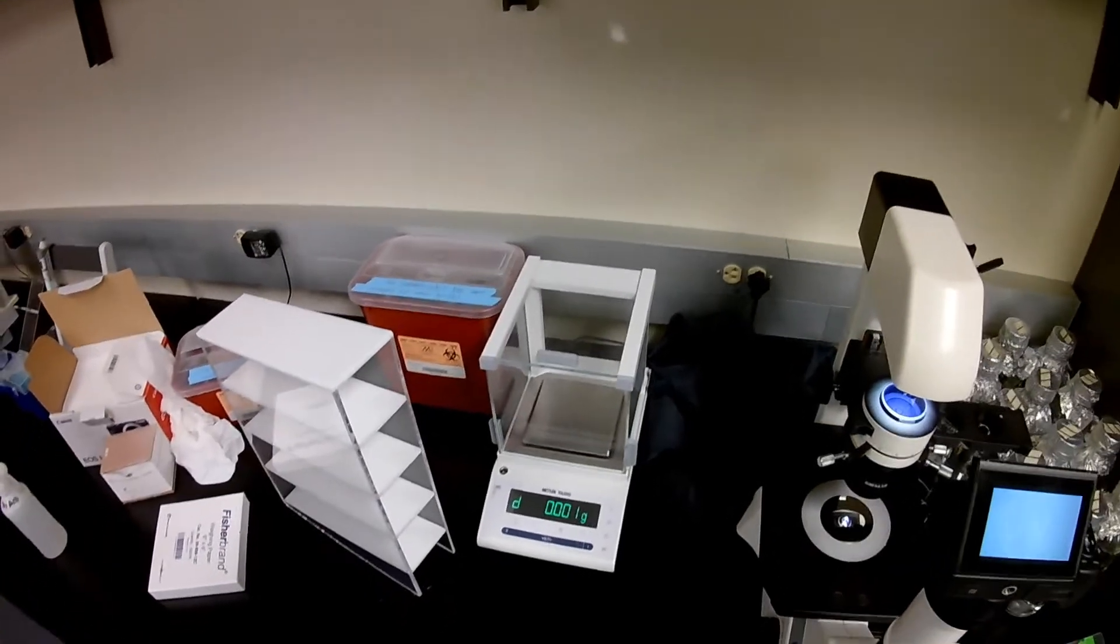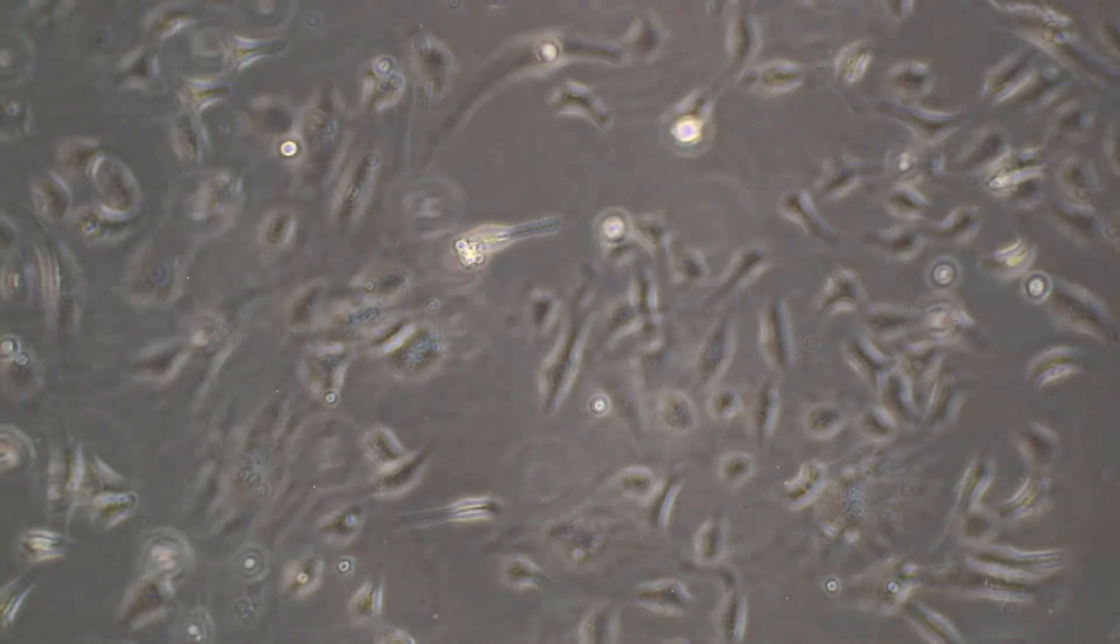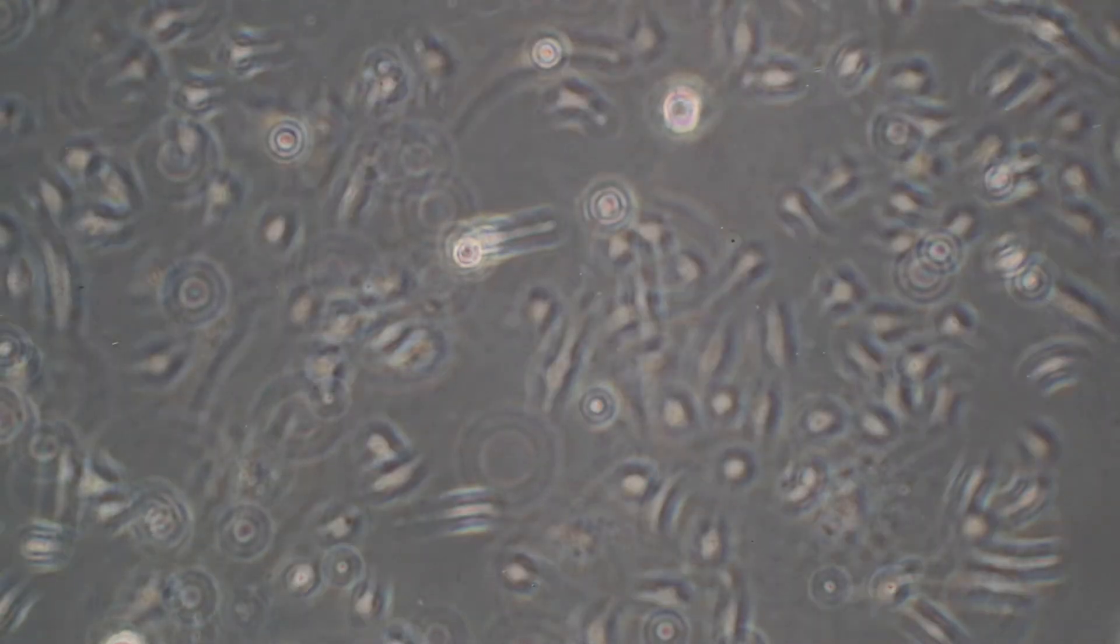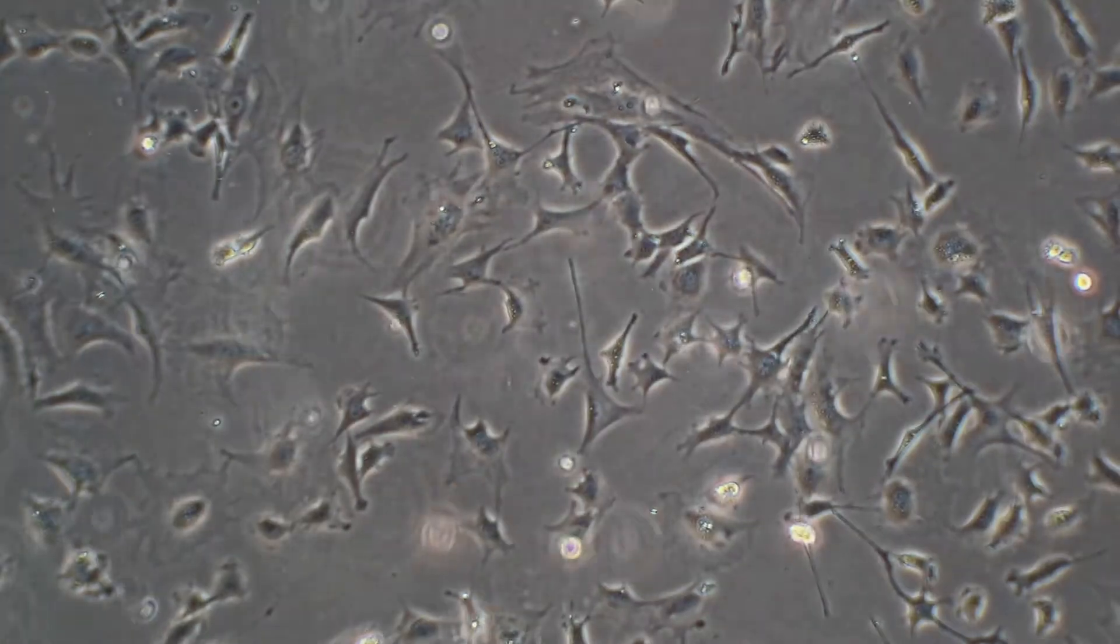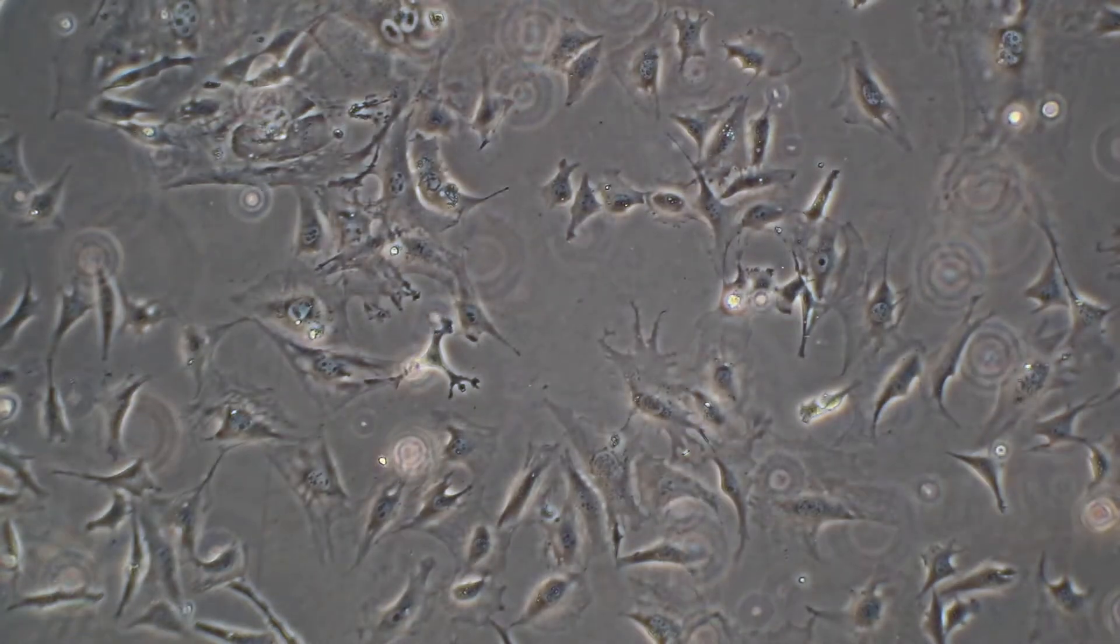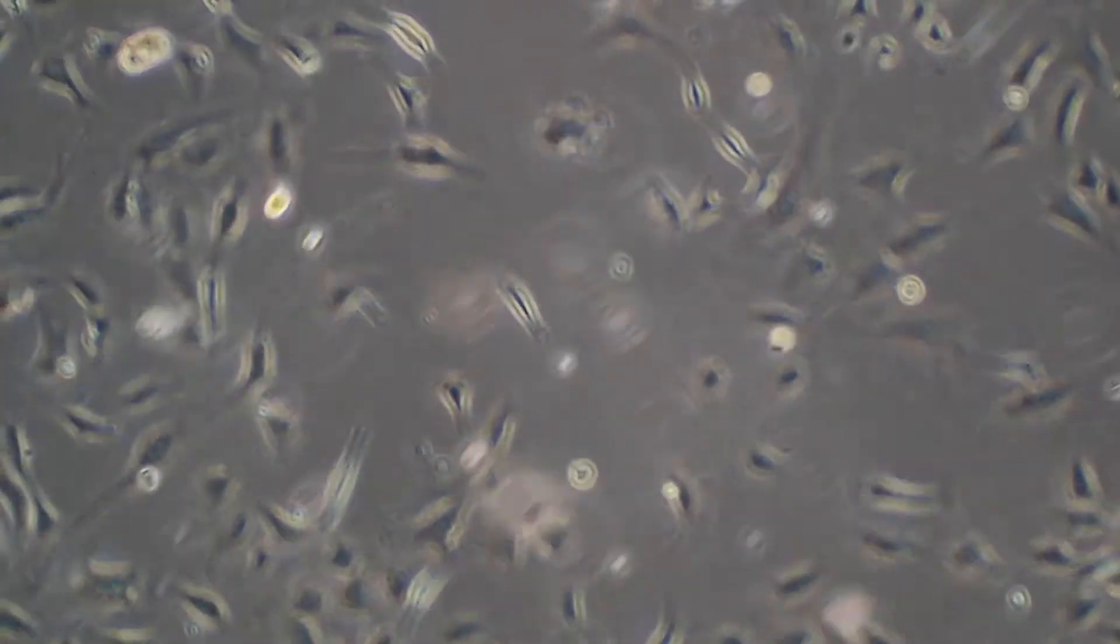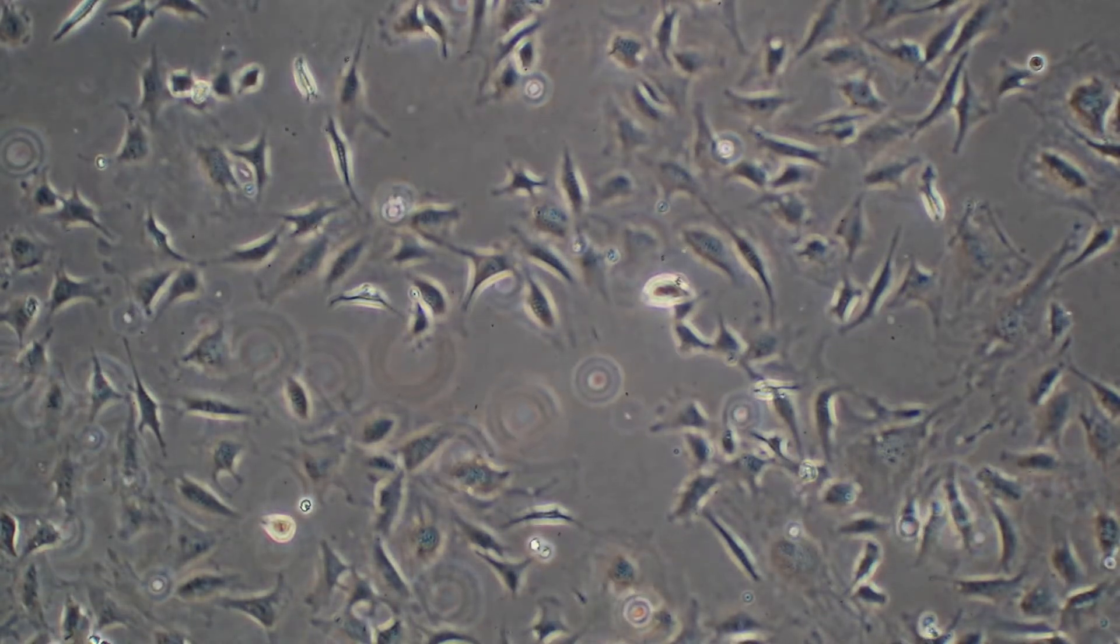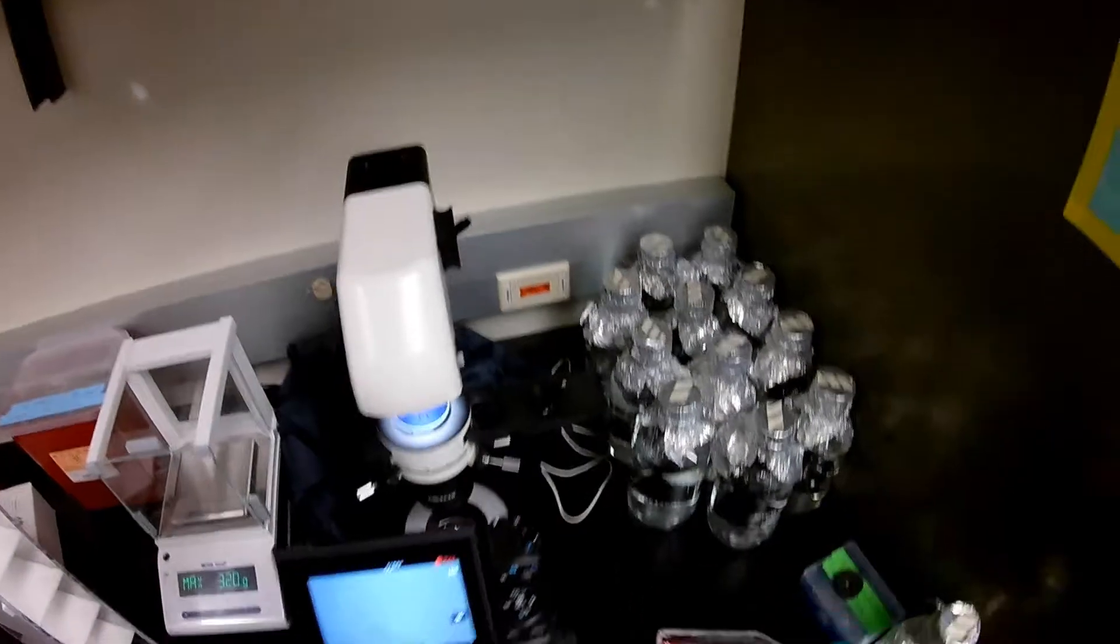Okay, first we're going to start with the cells that did not get centrifuged. So this is the minus sign, not centrifuged. Let's go ahead and hit record on this. Make sure I'm focused. And so these cells look pretty good. You can see this is typical of cryo storage. There's some dead ones that didn't make it, so you see the floaters. But we have a lot that have really done a good job and are starting to grow. I'm going to scan the whole flask to make sure the density is pretty consistent. I'm going to call this in the 60-ish percent confluence. It looks pretty good to me, but I don't think it's quite time to passage. So I'm probably going to have to come back tomorrow and go ahead and passage them, but I'm going to feed them today anyway just so you can see that process.